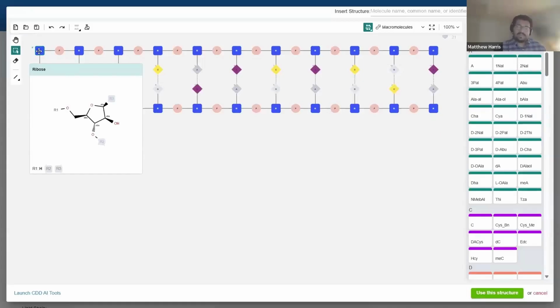One thing we like to say with the macromolecules is that they're being registered in a chemically aware fashion. What I mean when I say that is, as you can see, the correct bond formations and stereochemistry will be maintained within these macromolecules. You'll also be able to add and use any of these modified or unnatural bases in your sequences, as well as any hybrid sequences, as we saw in the beginning where we added those amino acids to the RNA strand. So the chemically aware registration allows all of those different modalities and information to be captured within these macromolecules.